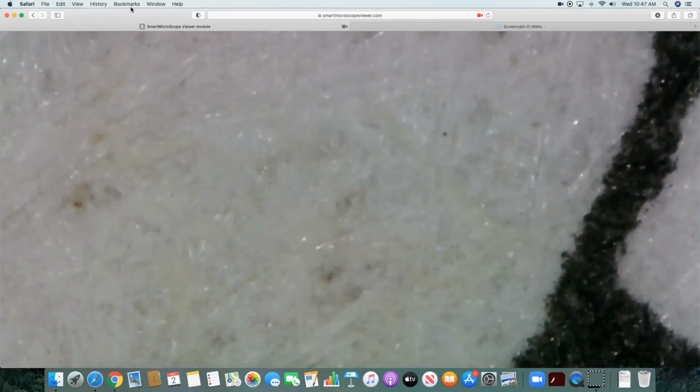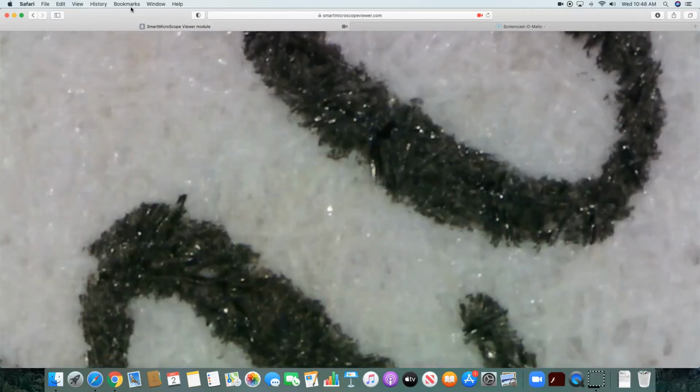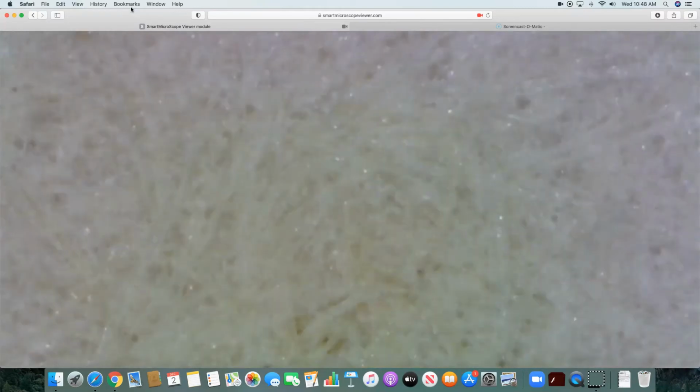Alright, and next, that was question 2: what do you notice about this paper from 2017? I'm going to move from this paper back to the old paper, and question 3 is going to be, what differences do you notice? So again, here's the 2017 paper, moving over. Do you notice any differences between this? This is the older paper.